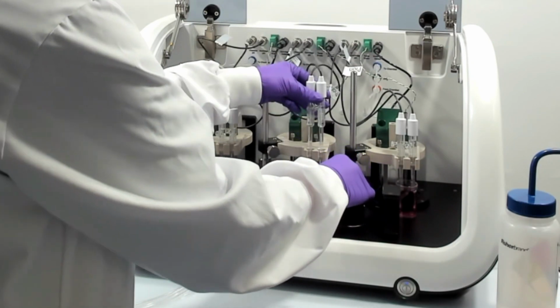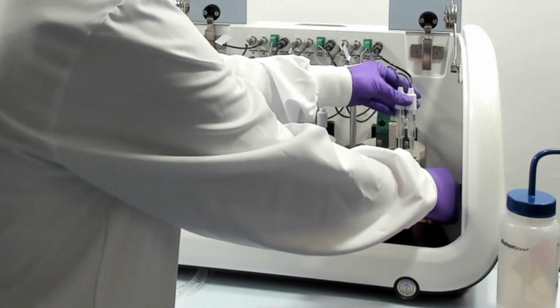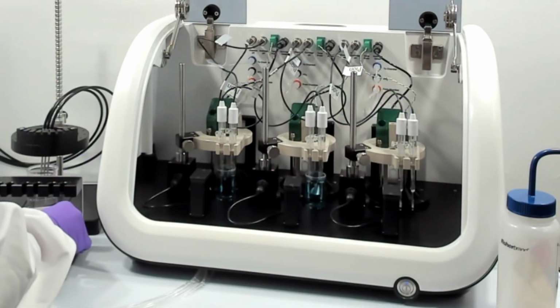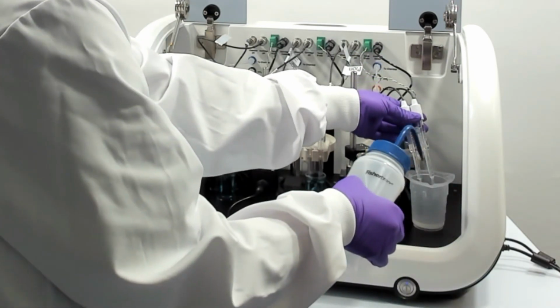It's important that we do a pH calibration before every assay that we run, just to make sure that the electrodes are responding correctly and that they're properly interpreting the pH values that they're reading.